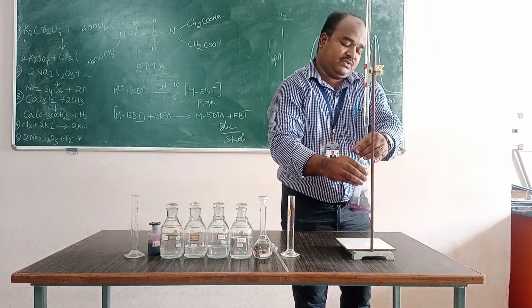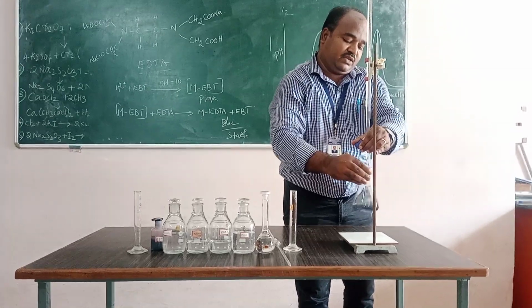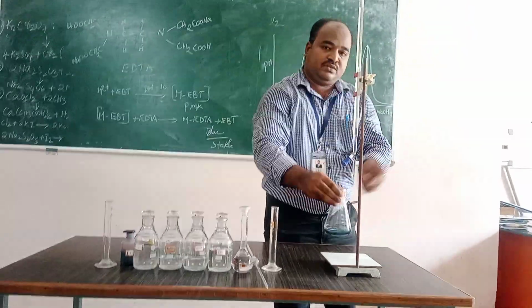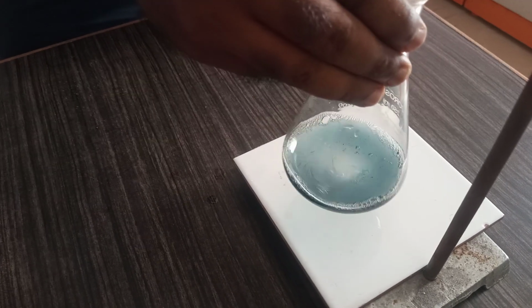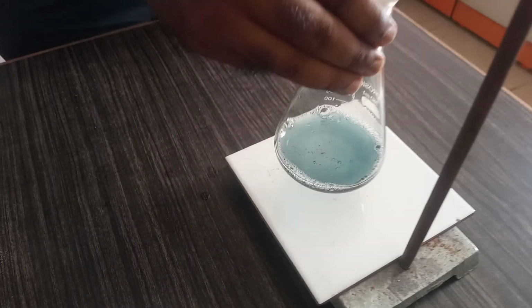It's taking time to form a bond between zinc and EDTA. Now it's okay. Now you can see the color has changed within 1 to 2 drops. Now it is a permanent color. You can see here the wine red color has converted into a light blue color, which is very near to a green and blue color combination. So this is our end point.